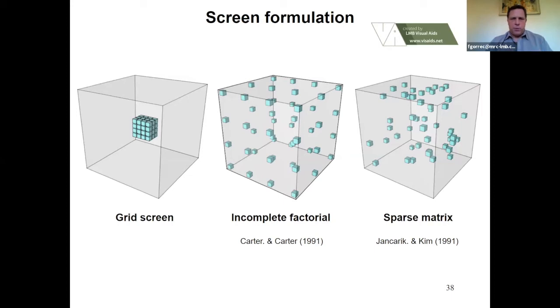If you want, for example, to see systematically what's happening against a pH and a concentration, you will formulate a grid screen. The problem initially is that you have so many suitable reagents that need to be tested that you will end up with millions of combinations.